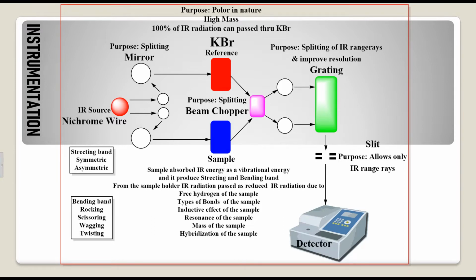These six different factors play a major role in the sample absorbing the IR radiation. When the IR radiation energy and these factors' energy match, there will be absorption.